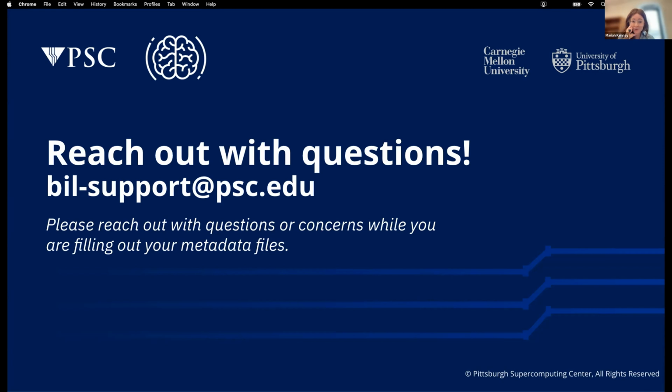What kinds of resources do we have available for you to interact with your data either before you've published it or with other published data sets that are on BIL already? And so we'll go over that tomorrow, and some new and interesting things that are happening at BIL.